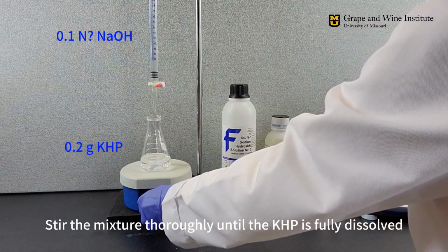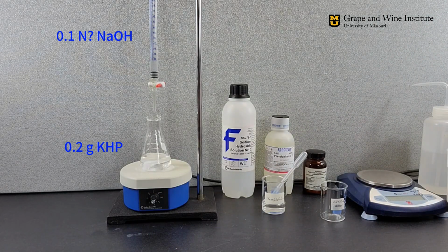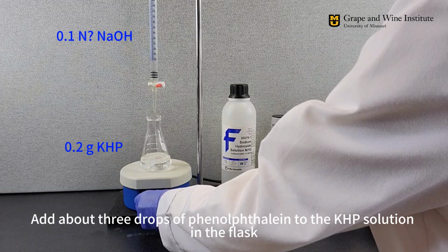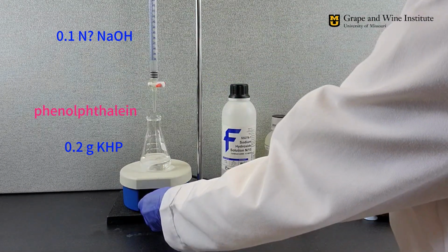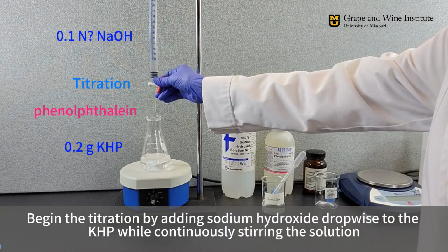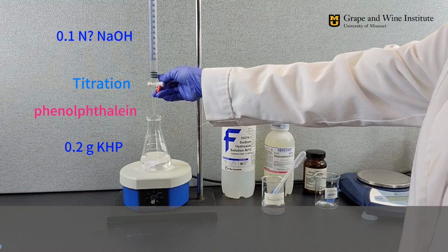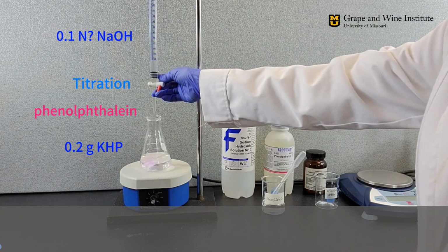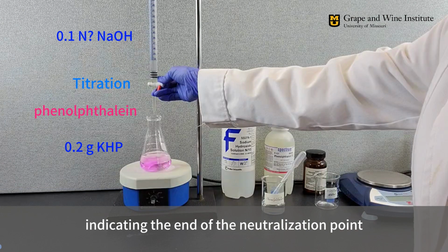Stir the mixture thoroughly until the KHP is fully dissolved. Add about 3 drops of phenolphthalein to the KHP solution in the flask. Begin the titration by adding sodium hydroxide dropwise to the KHP while continuously stirring the solution. Keep adding until a pink color persists, indicating the end of the neutralization point.